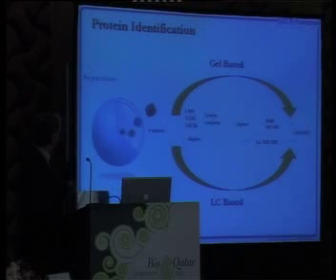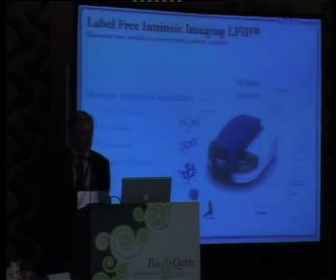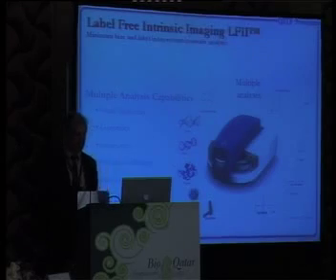Mode of identification can take a gel-based or liquid chromatography-based method through separation. The extraction of the protein is followed by this separation in one or two or multiple dimensions, leading to image analysis and finally through to identification using a mass spectrometer typically, whether it be gel or LC. Both will be available in the core facility we're building.